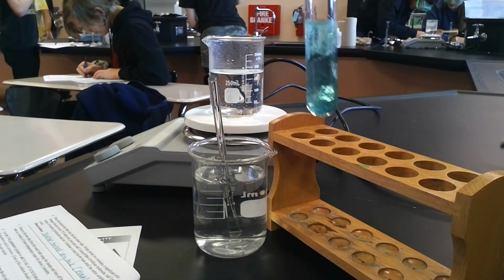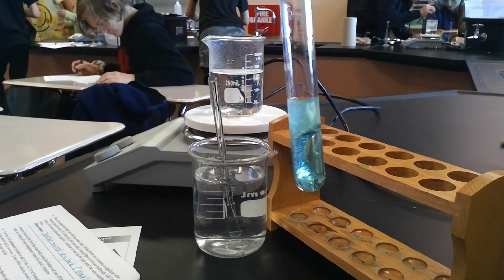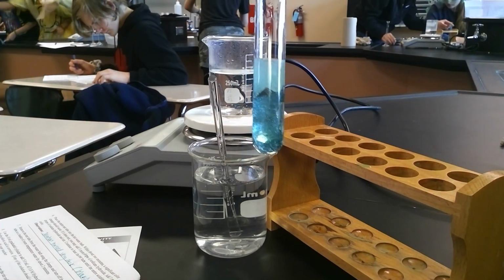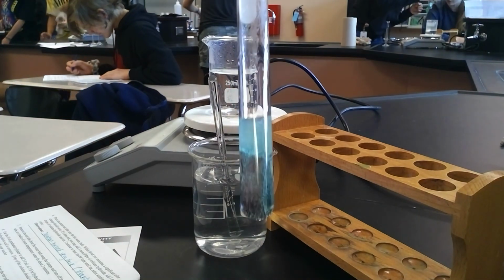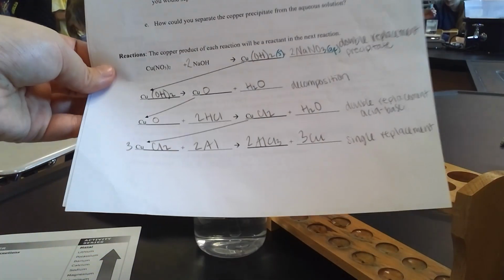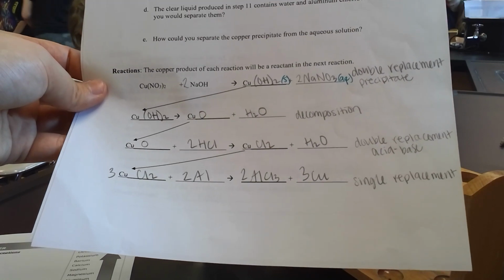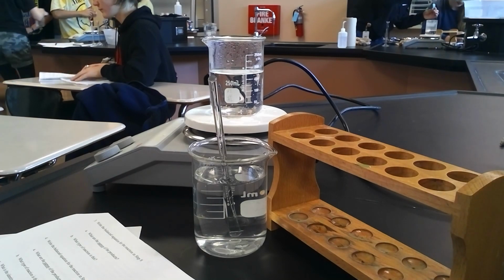And I'll hold this up so that we can see what's happening. So it said swirl it. I'm going to let it actually kind of take its course for a second. That way you can see on the video what's occurring. So right away I see bubbles, which tells me that a gas is produced. And so this is something that I wanted you guys to see in terms of the error that you're talking about. If I have copper 2 chloride reacting with aluminum to produce aluminum chloride and copper, no part of that should be a gas. So aluminum chloride is not a gas, copper is not a gas.